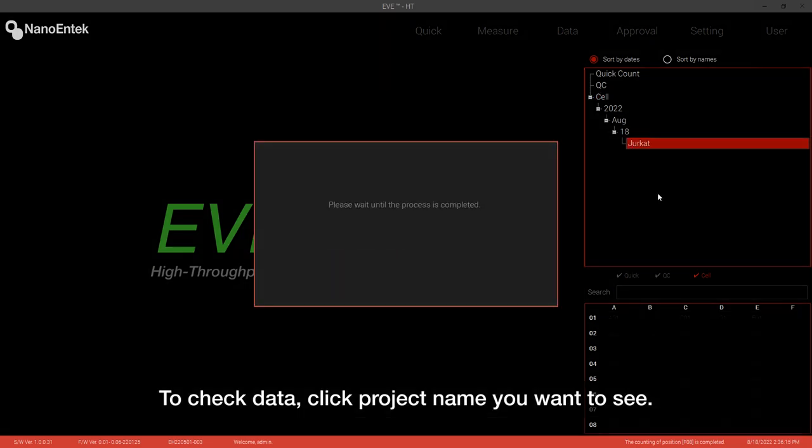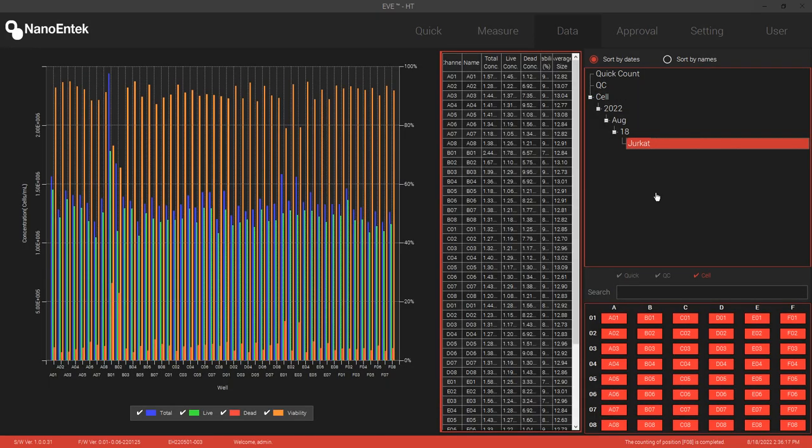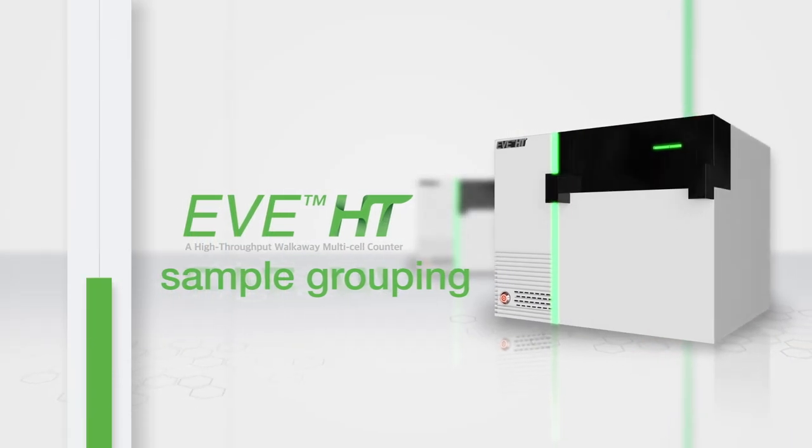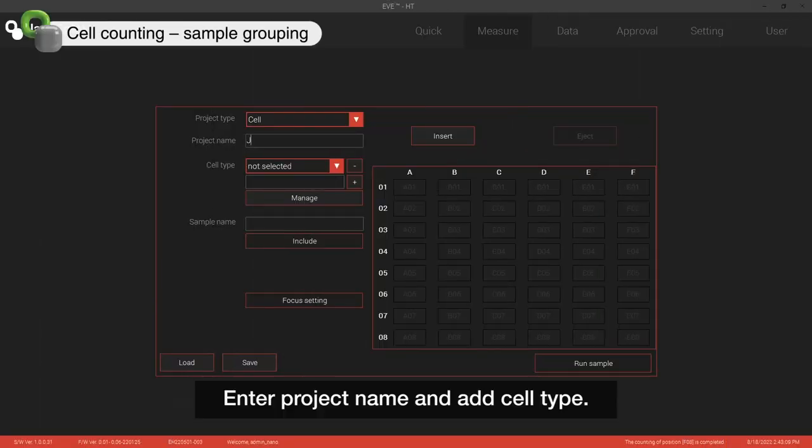To check data, click Project Name you want to see. See this section when using more than one sample type. Enter Project Name and add cell type.